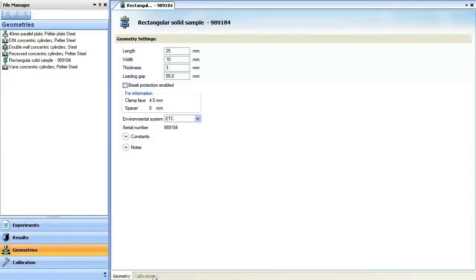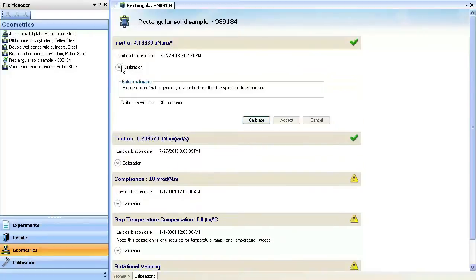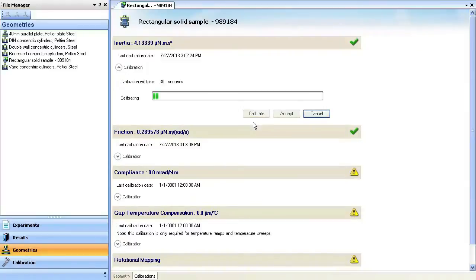With the geometry spacers fastened, the inertia, friction, and compliance calibrations can be performed. Click on the Calibration tab and expand the inertia calibration. Click Calibrate to initiate the inertia calibration.